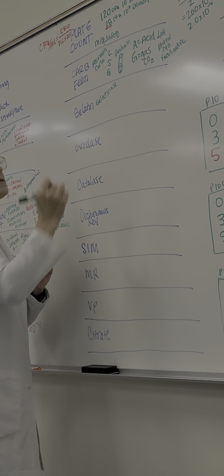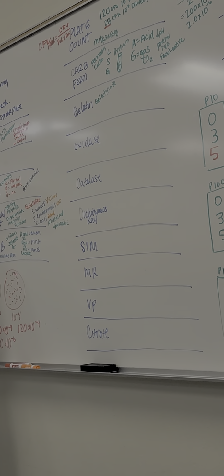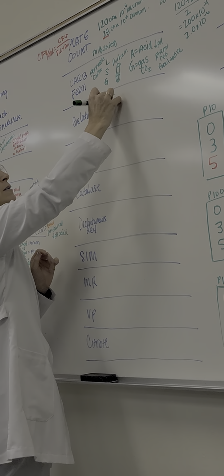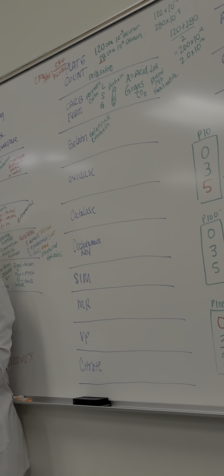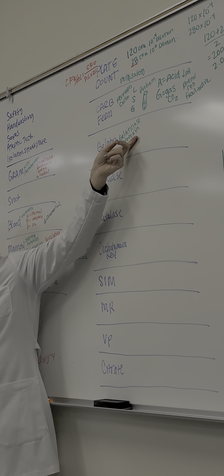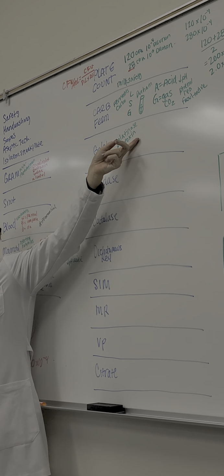Gelatinase, which is a what? Do you guys know what gelatinase is? Do you remember broadly? It's an enzyme. It's also an exotoxin. Because we are made of gelatin. All of our connective tissue is made of gelatin. So if you have a gelatinase enzyme, that's not good. An organism that spits out toxins that degrade connective tissue, that's not good. So it's an exotoxin. It's a gelatinase enzyme.